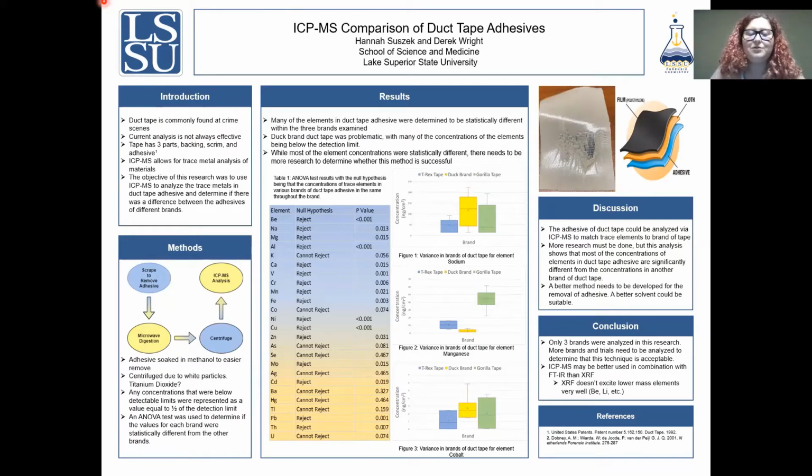Hey everyone, this is Hannah Suszek, and my research project was a lab-based project where I attempted to use the ICP-MS to analyze the trace metals in duct tape adhesives to attempt to match the sample of tape to a specific roll or brand of tape.